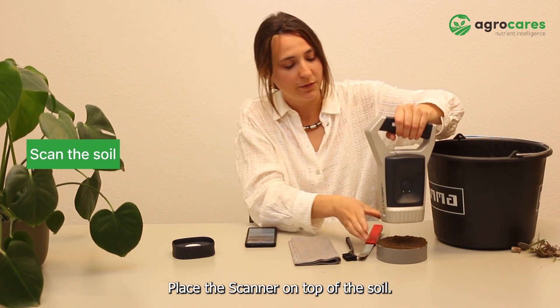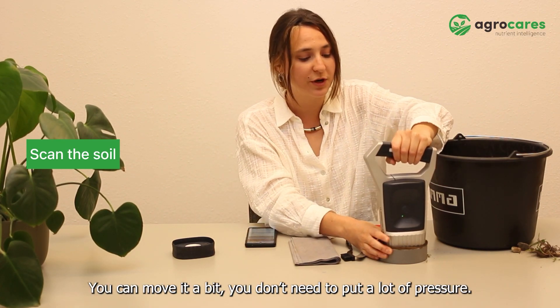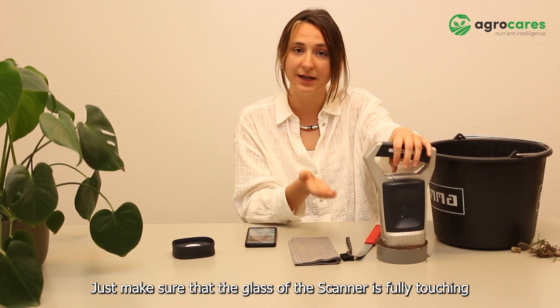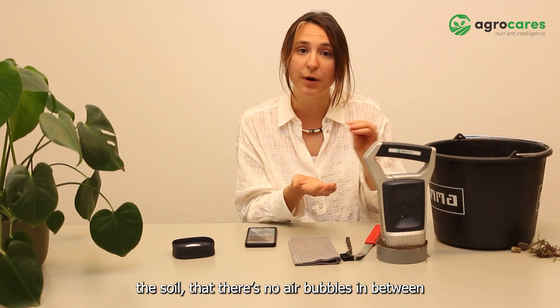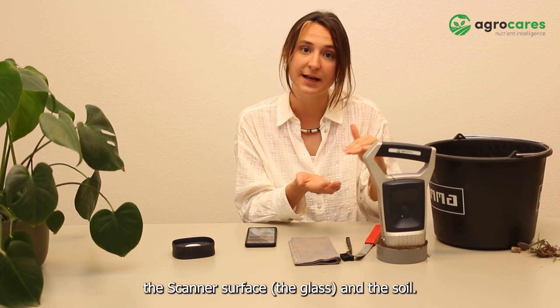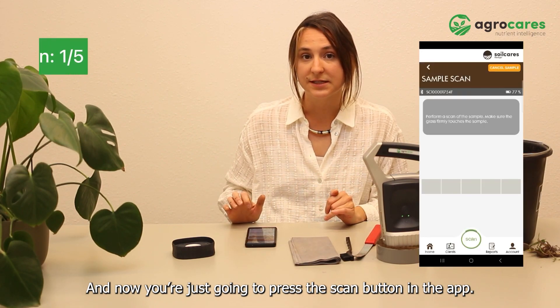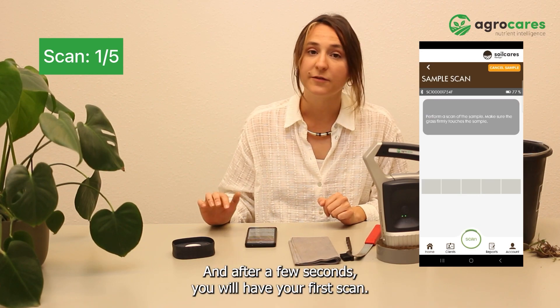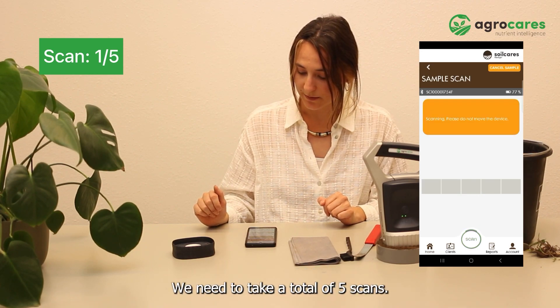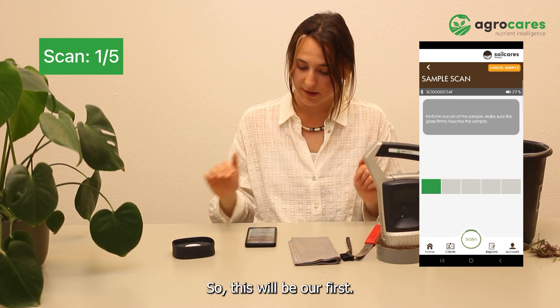Place the scanner on top of the soil. You can move it a bit. You don't need to put a lot of pressure — just make sure that the glass of the scanner is fully touching the soil, with no air bubbles between the scanner surface, the glass, and the soil. Now you're just going to press the scan button in the app. After a few seconds, you will have your first scan. We need to take a total of five scans, so this will be our first.